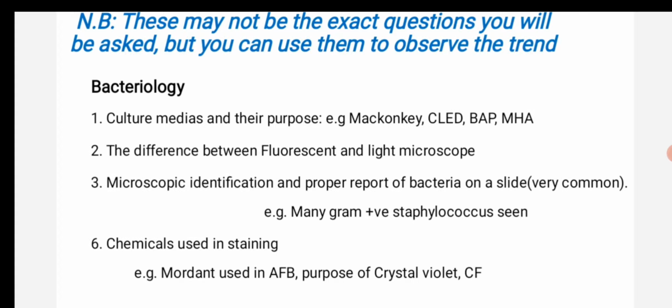Staining, microscopy, and culture media. Sometimes we will be given some biochemical tests and asked to identify their purpose. Also, we may be asked to measure the susceptibility and resistance behavior of some strains.